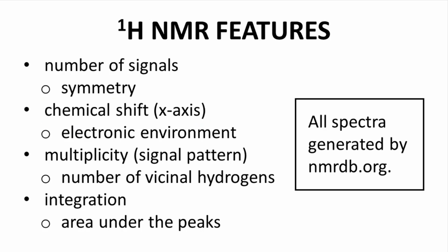The different spectra in this video were generated by the website nmrdb.org, a fantastic resource.